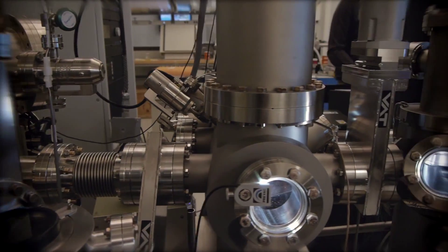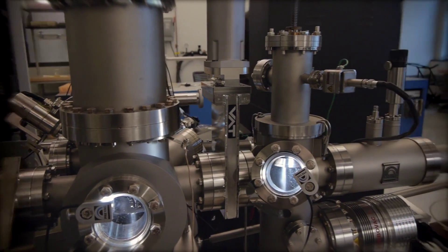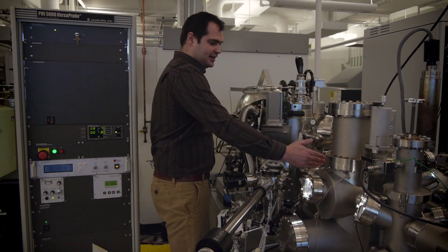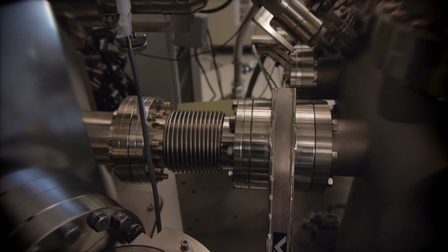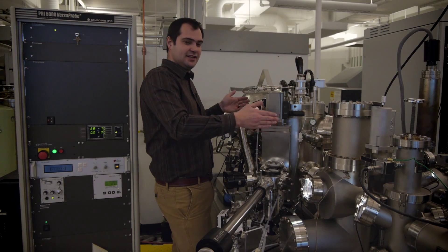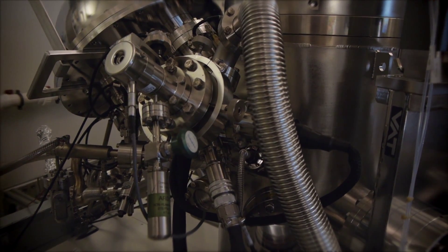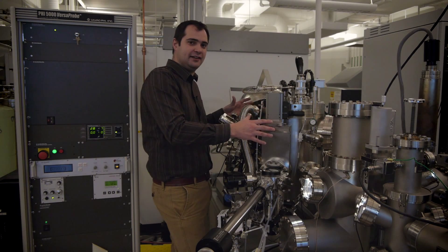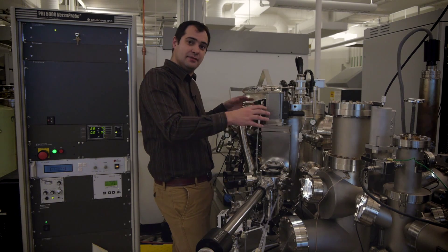Our system is comprised of sections which we can isolate as different parts. Here we have isolated the chamber using these gate valves, which separate our chambers so we can maintain different pressures. This is our main chamber and we always try to keep it in the best ultra-high vacuum conditions that we can, aiming for base pressures of 1 times 10 to the minus 10 millibar.